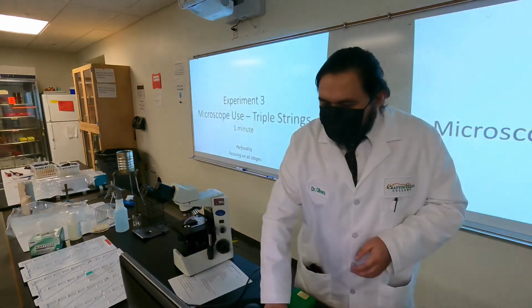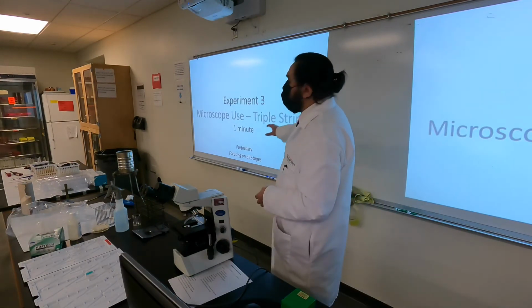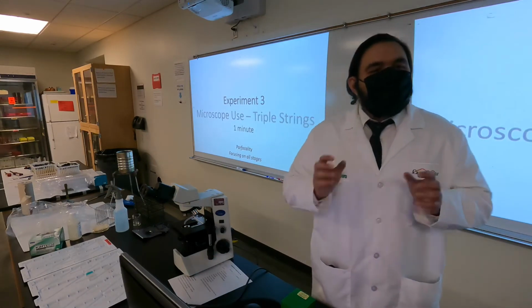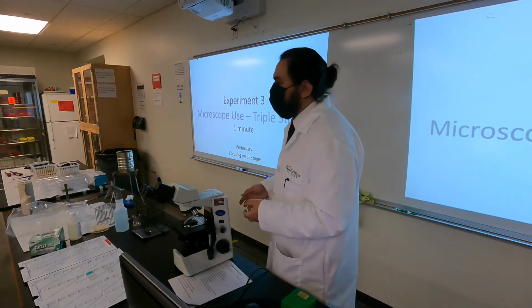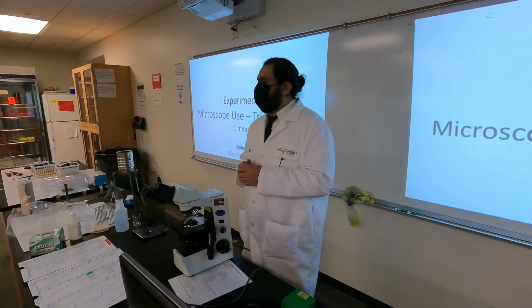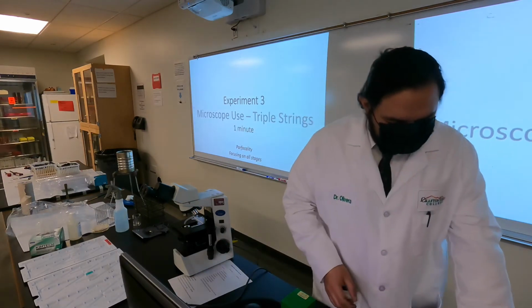So our first trial is going to be our triple strings, and we're going to look for the first level. So you should place your slides under the stage clip, raise your stage until you find your first image of the triple strings, okay? And then your first practice of using your phone to take a picture of it. All right, so let's start with that first.